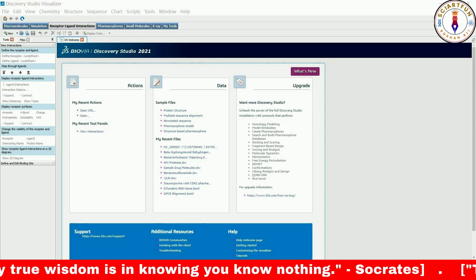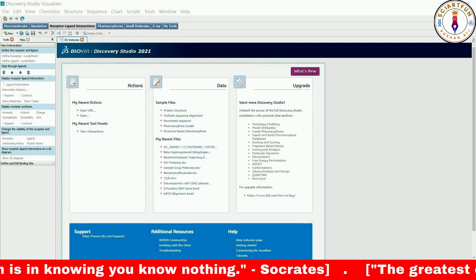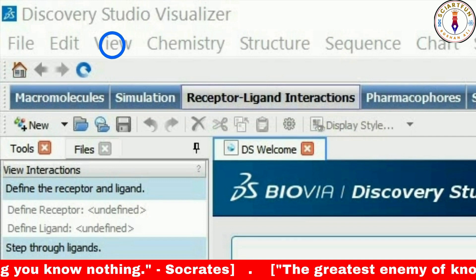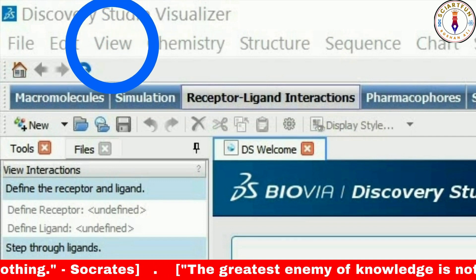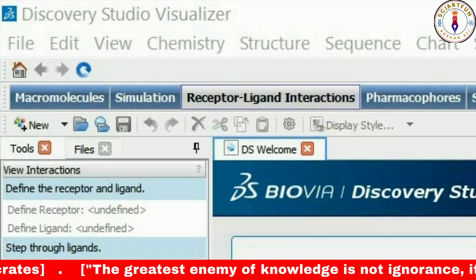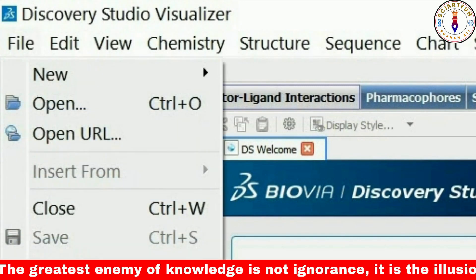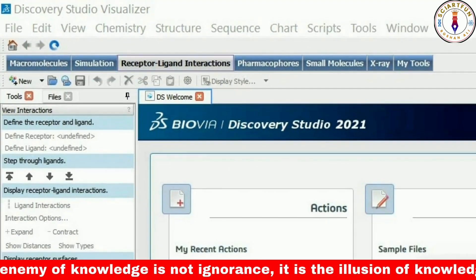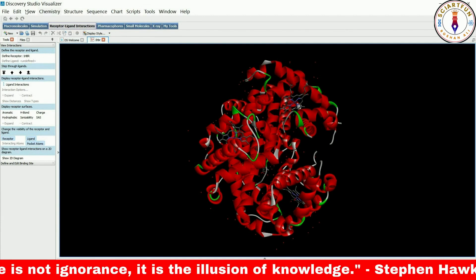In today's lesson we will be discussing the different options available in the View menu of Discovery Studio Visualizer. To get started, we will need to open a protein model first.